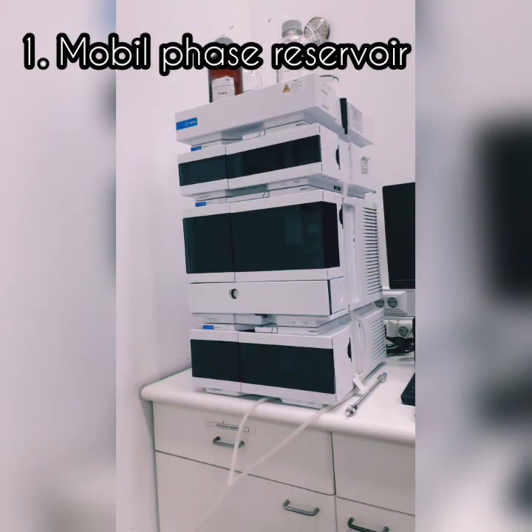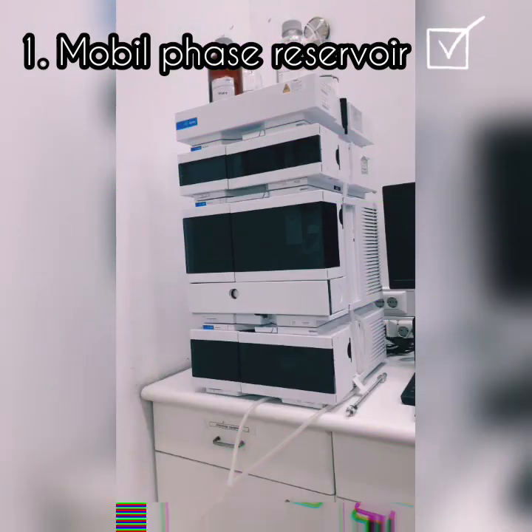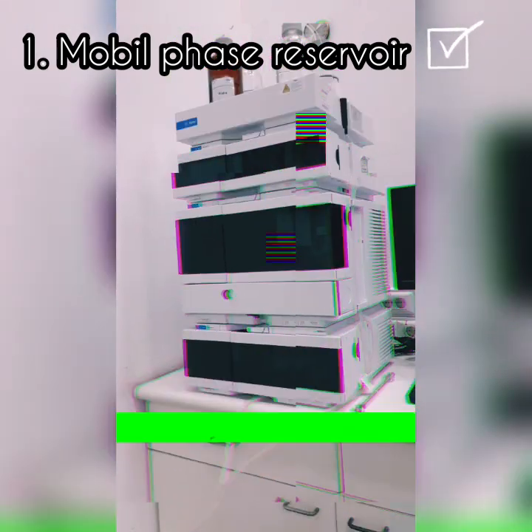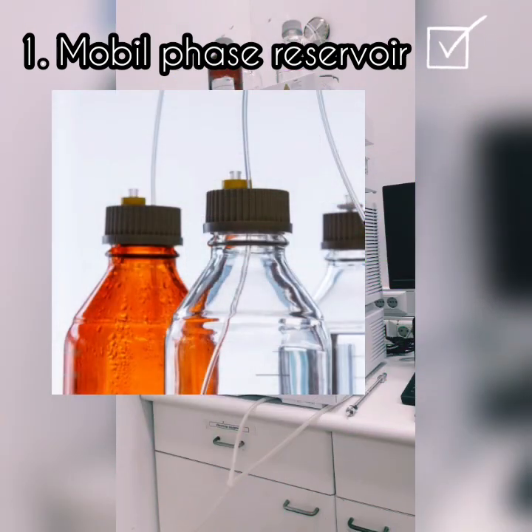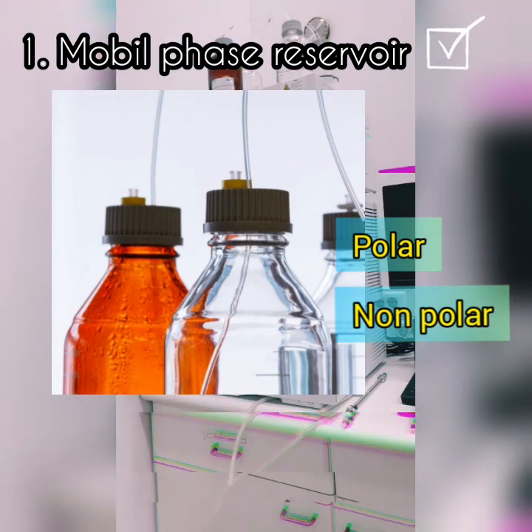Number one is solvent reservoir. Mobile phase contents are contained in a glass reservoir. The mobile phase or solvent in HPLC is usually a mixture of polar and non-polar liquids. Components with respective concentration are varied depending on the composition of the sample.